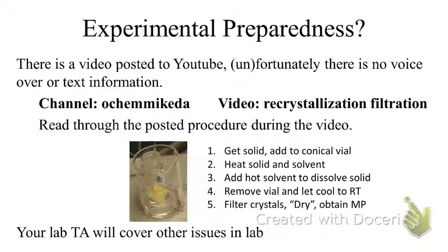Purity. The whole goal of the recrystallization was to purify the compound. We want to be able to go to the end, identify our compound, and verify that we actually did it correct. Okay? Your TA should be able to cover any other issues in the lab.